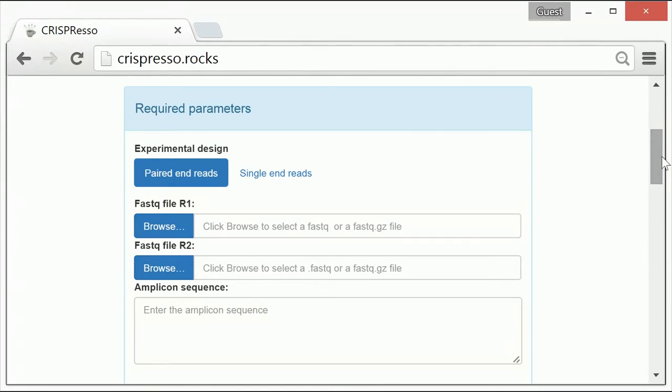This sample data is paired-end sequencing data using the Cas9 nuclease to produce a spectrum of insertions and deletions, or indel mutations. Therefore, I have selected the paired-end reads option.